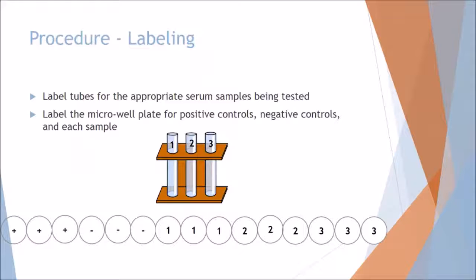As you can see here, we have each of the samples in triplicates in the plate, so that we'll have enough data for each of those.